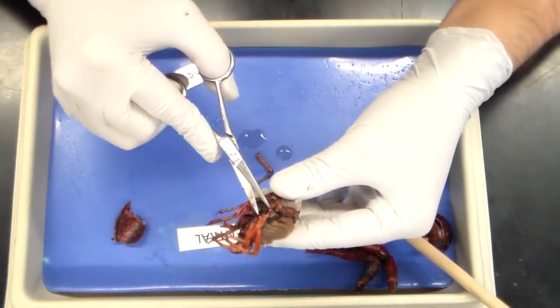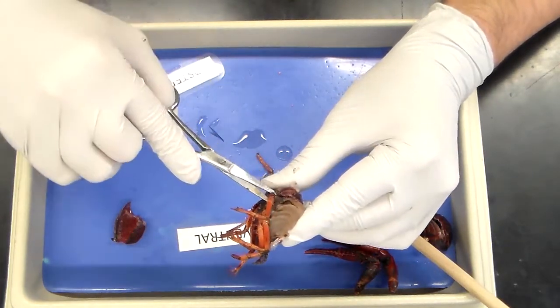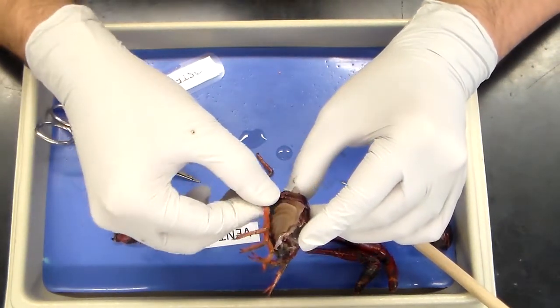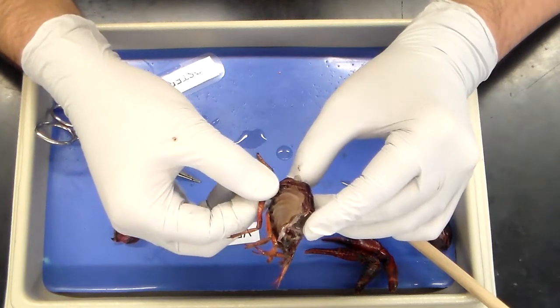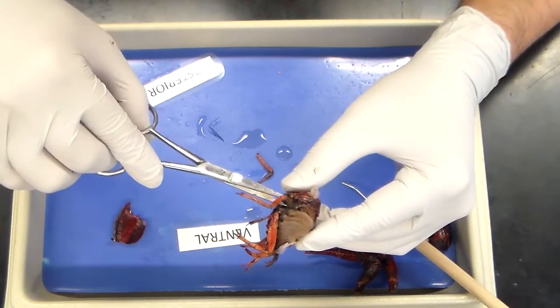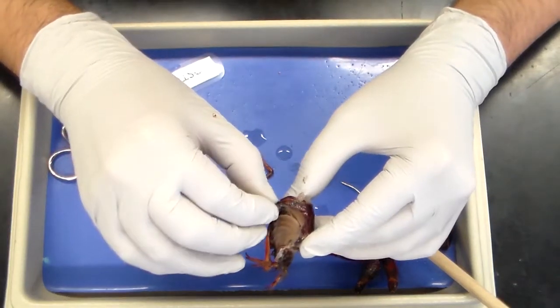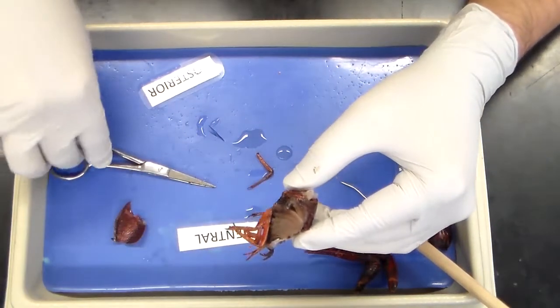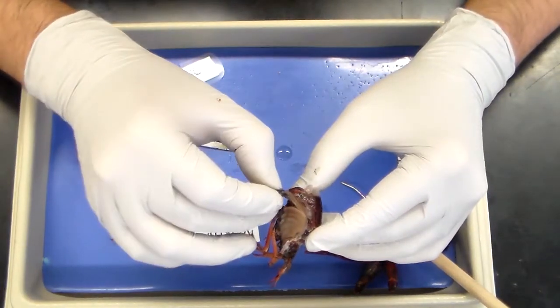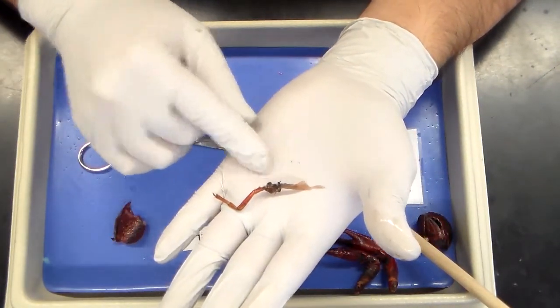The next thing we're going to do is remove a walking leg with the gill intact and observe it in the dissection microscope. To do that, go ahead and cut underneath the walking leg and gently pull. It should detach very easily. If it doesn't, make sure your cuts are thorough. We'll go ahead and put this in a petri dish and observe it.